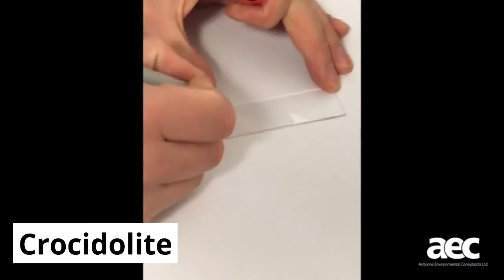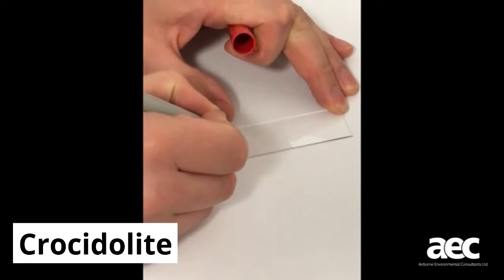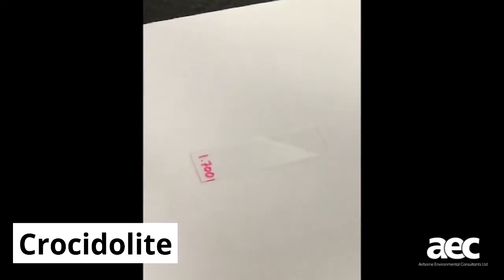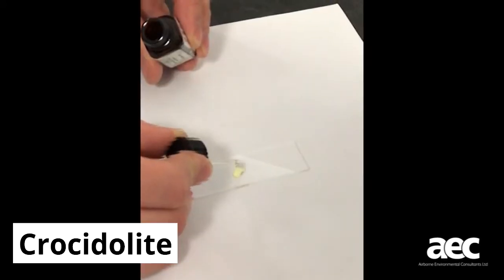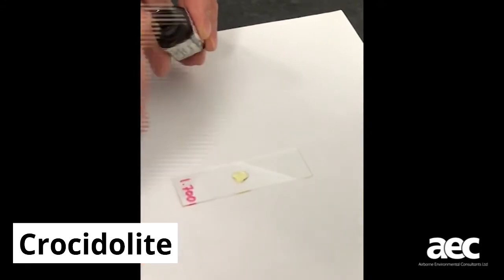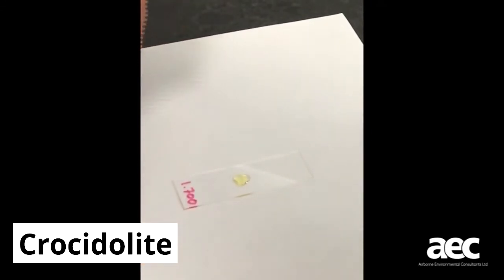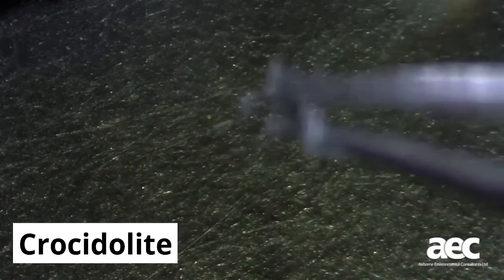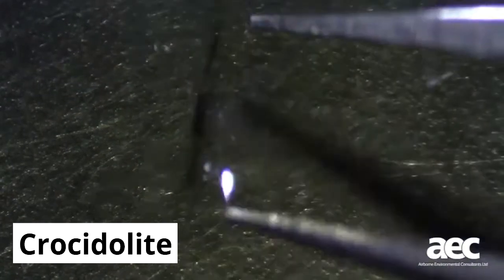These need confirming as crocidolite fibres, so a slide is prepared with a refractive index liquid of 1.700, which means it slows light so that it takes 1.7 times longer to get through the liquid than it would a vacuum, such as space. This is exactly how light reacts when it passes through crocidolite.